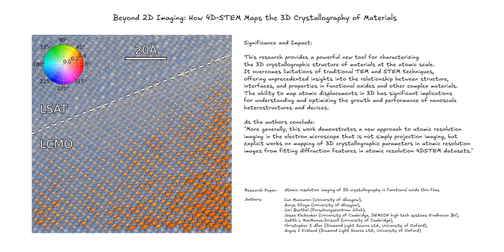Perovskites have a specific arrangement of oxygen atoms forming what we call octahedra. These octahedra can rotate or tilt relative to each other. And these tilts directly impact the material's electronic and magnetic properties. By manipulating the A-site modulation direction, we can indirectly control the octahedral tilting.